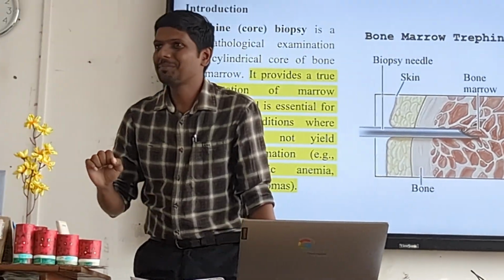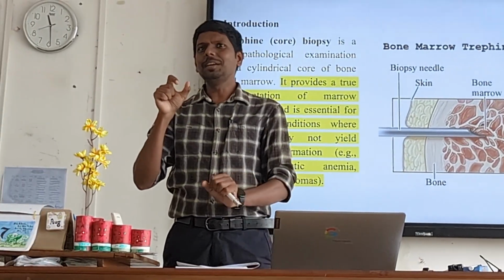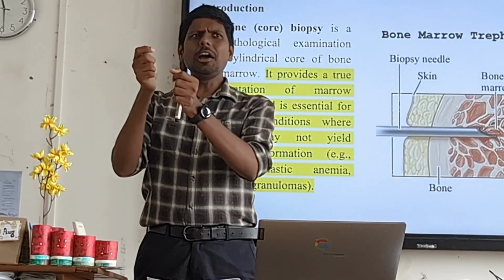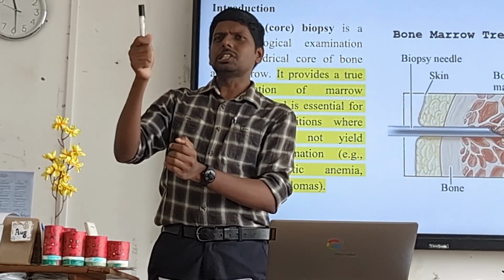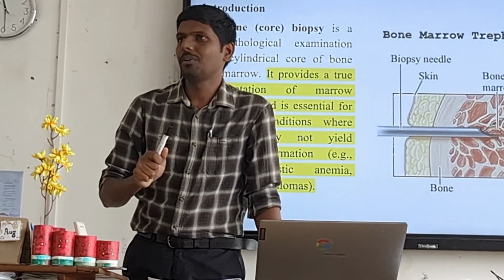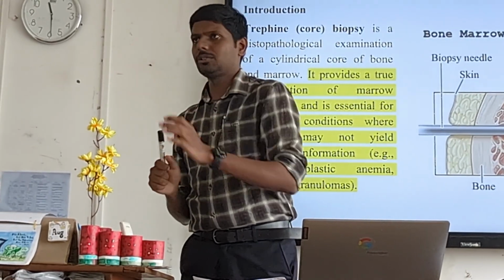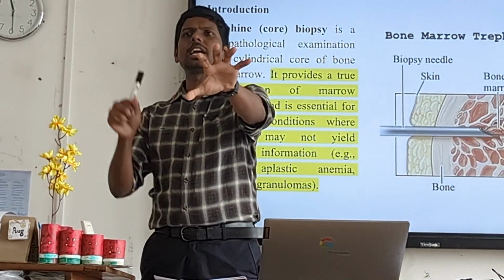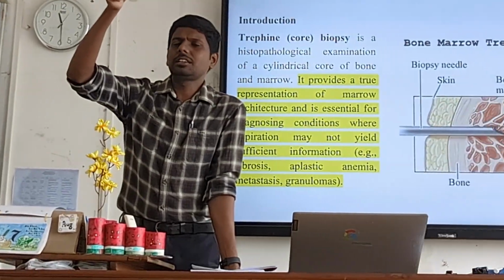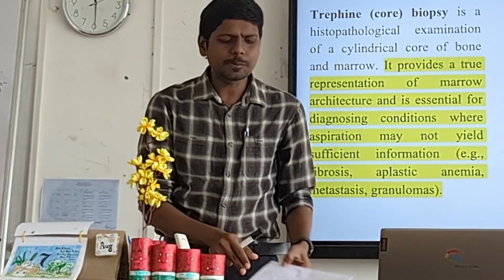Okay, that is clear. Now let us come back to our tissue processing. Some more interesting things. Let me give you an analogy. I have given you the sharpest knife in this universe. Very sharp knife you have. And I gave two samples to you, a piece of cake and a potato. I requested you to cut the cake into a very thin slice, thinner than this paper.